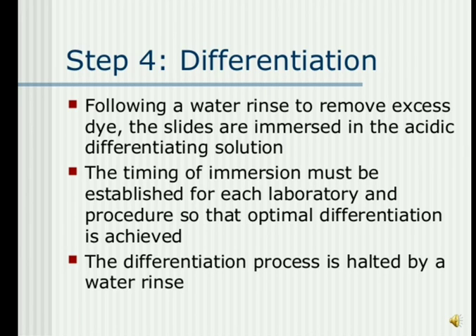Fourth step we have is differentiation. Following a water rinse to remove excess dye, the slides are immersed in an acidic differential solution. The timing of immersion must be established for each laboratory and procedure to obtain optimal differentiation. The differentiation process is halted by a water rinse.